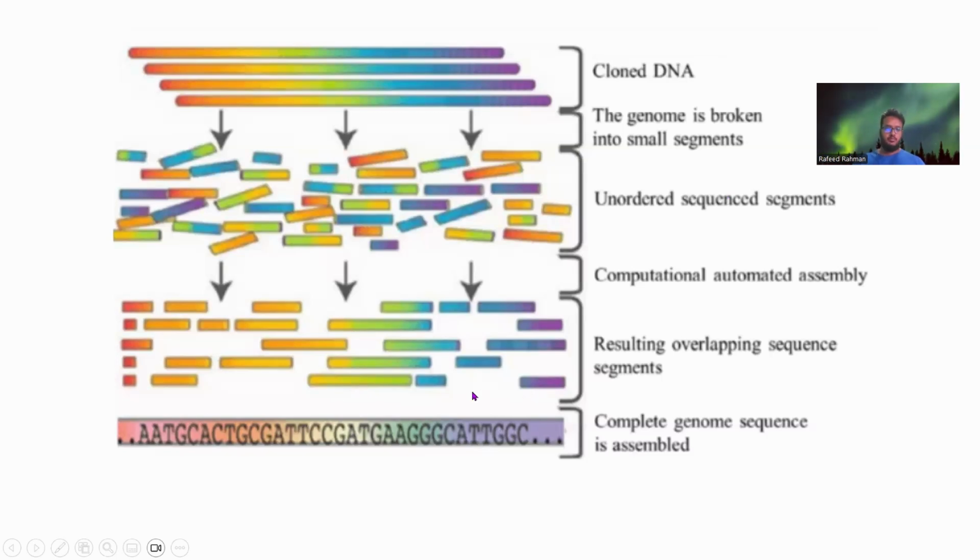That is the entire process for sequencing, but we are mainly going to focus on the cloning, the fragmentation, and mostly the sequence reading part, because that is at the core of the sequencing. The last part that I talked about, the alignment part, is not really part of the sequencing machine. Rather, it is done using some library, for example Bowtie or BWA. These libraries are used to do these things, so it's not part of the actual sequencing process.